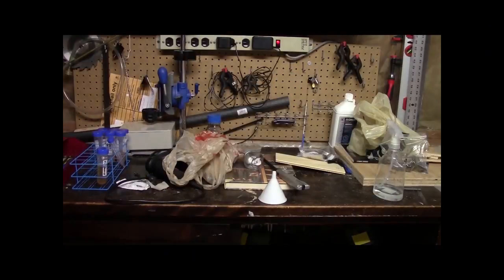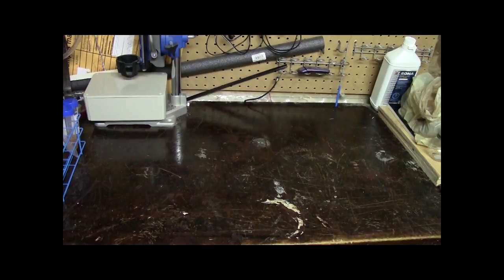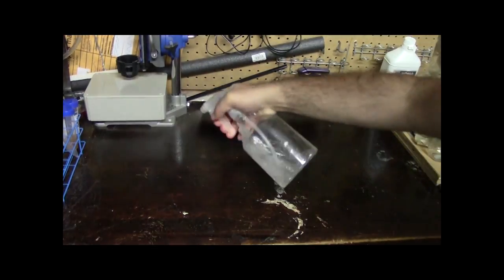As I mentioned in my first video, one of the most important things you need is a clean and uncluttered workstation. Before you start any work you're going to want to clean it off first with soap and water, and once that's dry you then want to spray it down with a sanitizing agent.